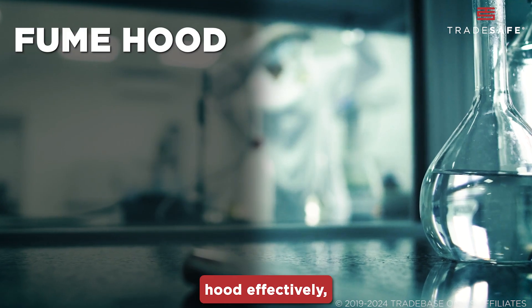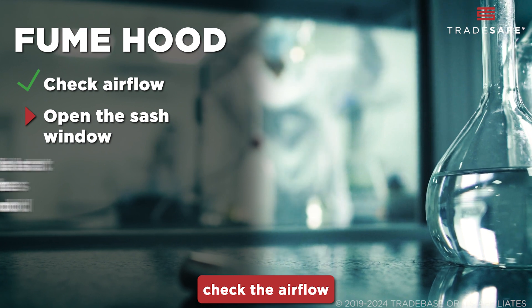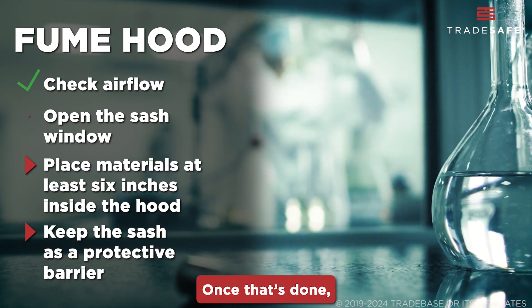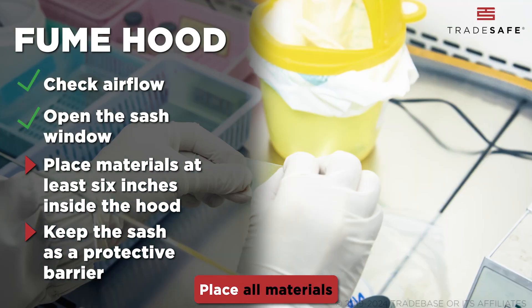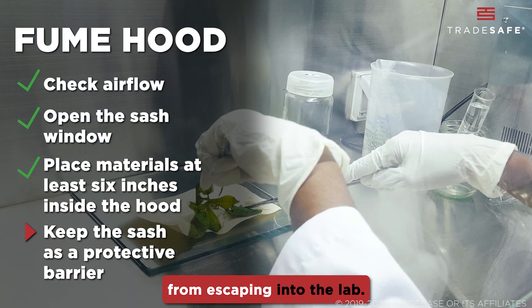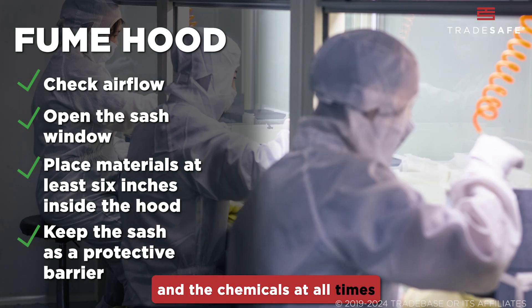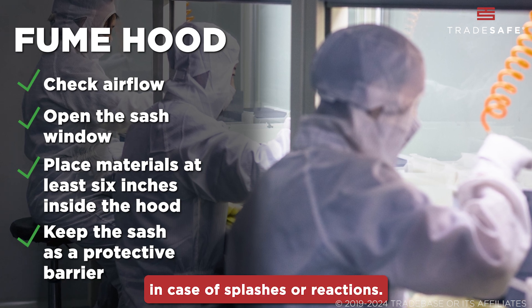To use a chemical fume hood effectively, first ensure it's operating properly — check the airflow and make sure the exhaust system is not obstructed. Open the sash window only as far as necessary to work comfortably. Place all materials at least 6 inches inside the hood to prevent vapors from escaping into the lab. Keep the sash between you and the chemicals at all times as a protective barrier in case of splashes or reactions.